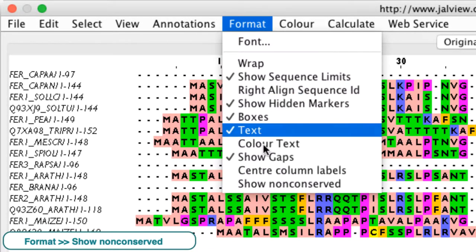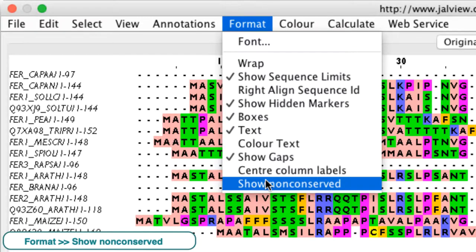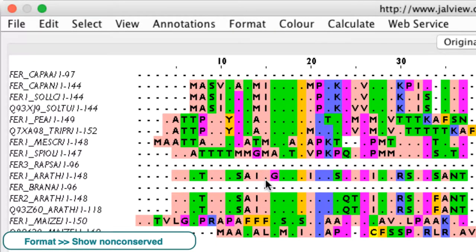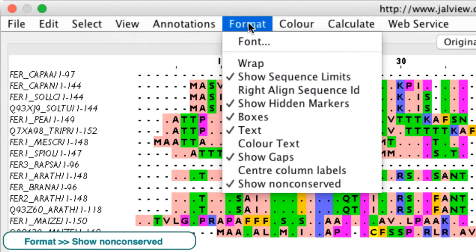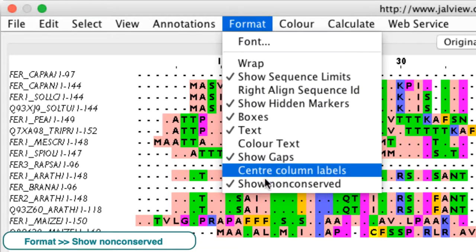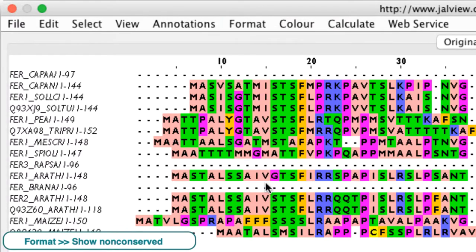Show non-conserved is useful for highlighting mutations in highly conserved alignments as it renders all consensus sequence symbols as a dot.